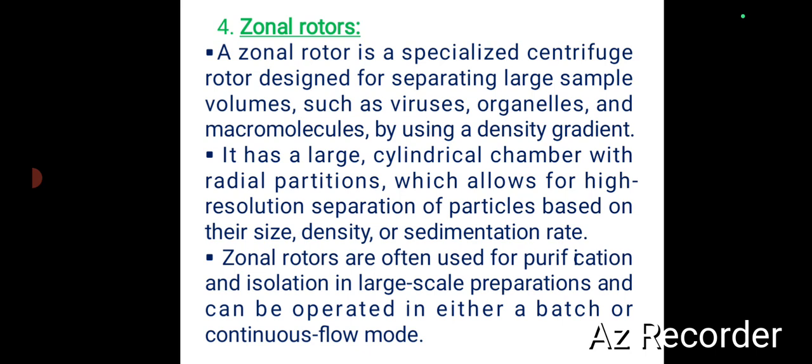It has a large cylindrical chamber with radial partitions which allows high resolution separation of particles based on size, density, and sedimentation rate. The zonal rotors are often used for purification and isolation of large scale preparations and can be operated in either batch or continuous flow mode. These are the further types of zonal rotor: batch type and continuous flow type.